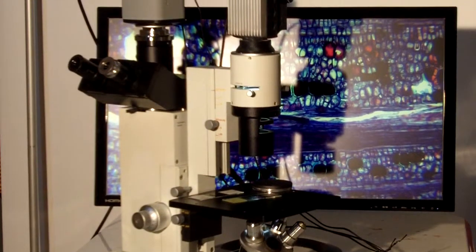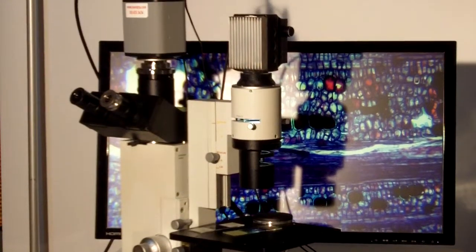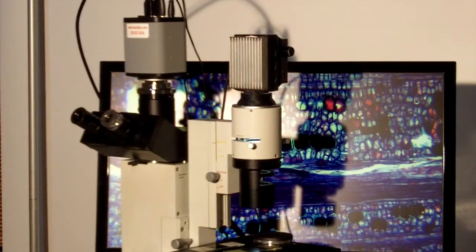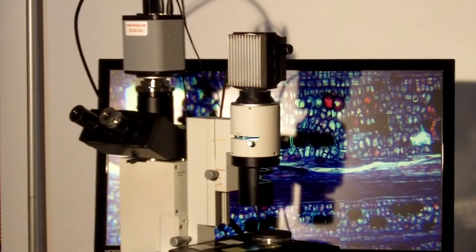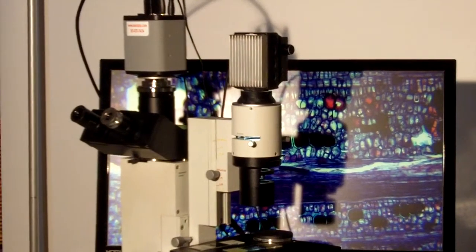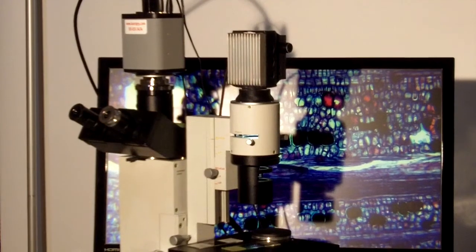Here's the Diavert with a trinocular tube, and attached is a modern HDMI high-resolution high-definition color camera and LED light source on the right.